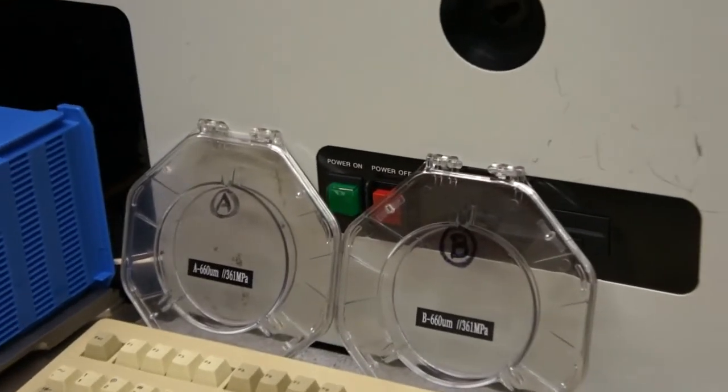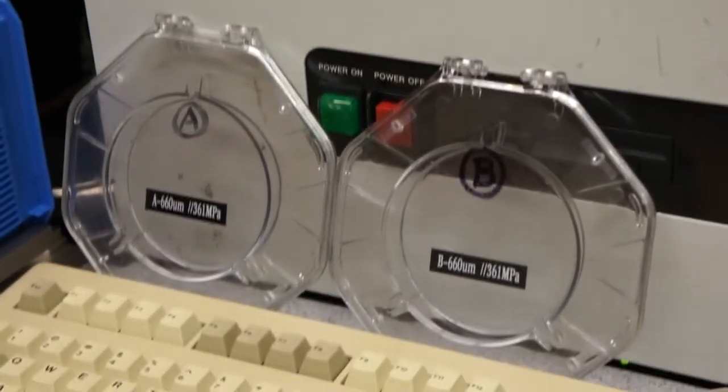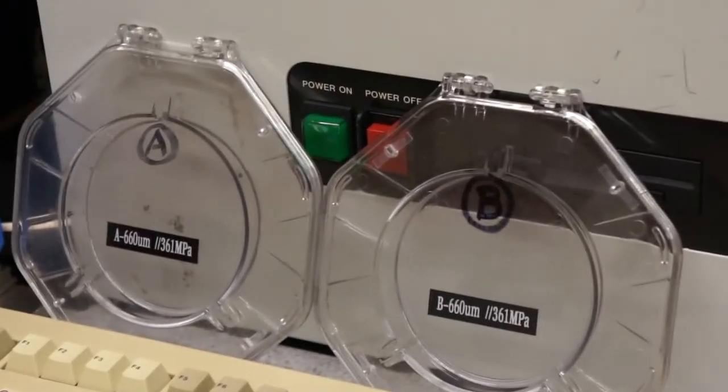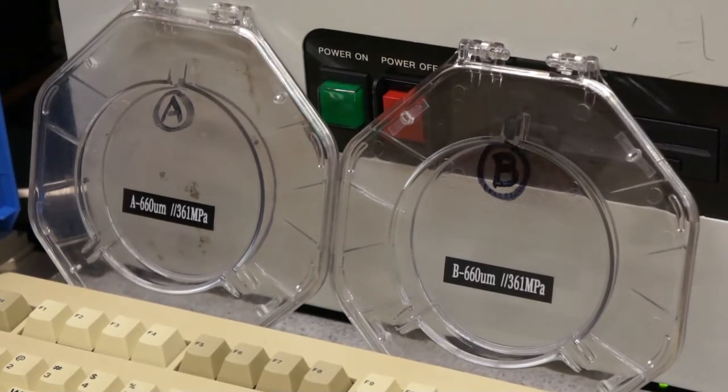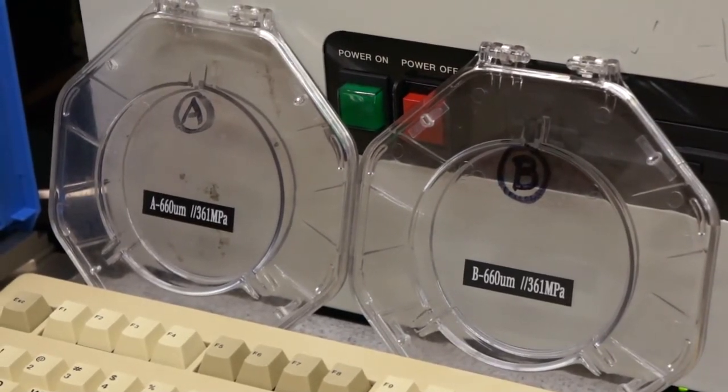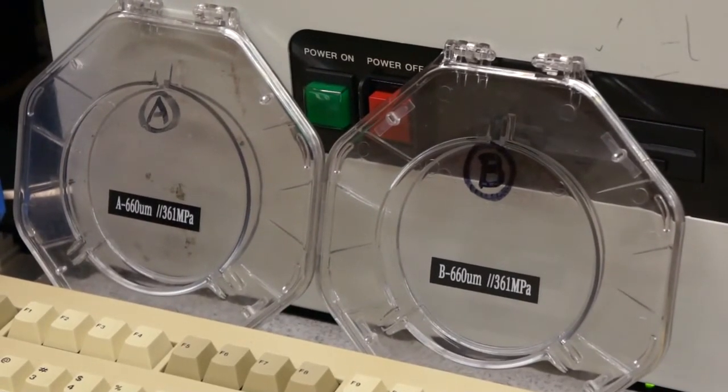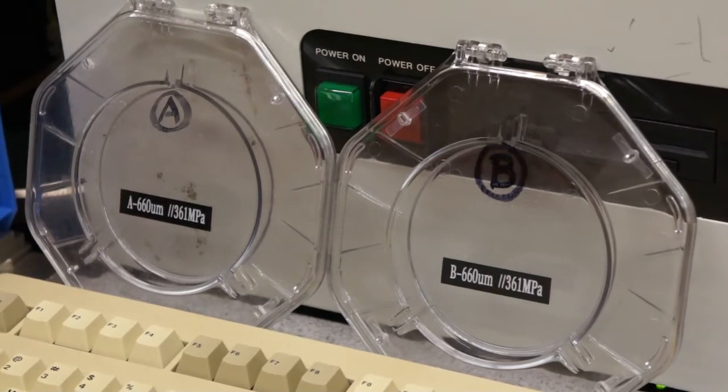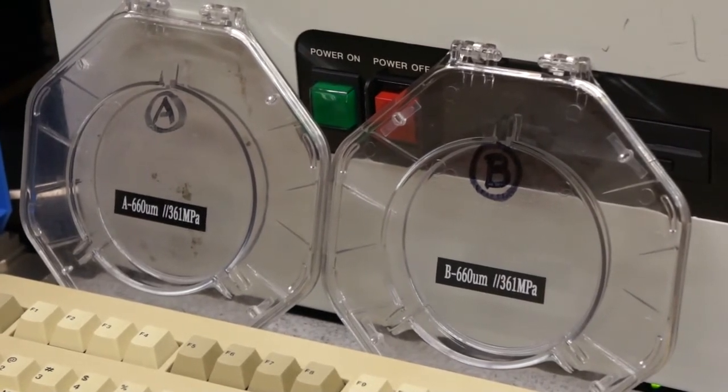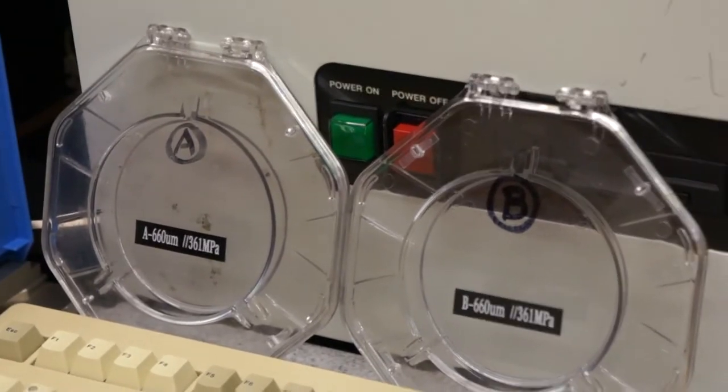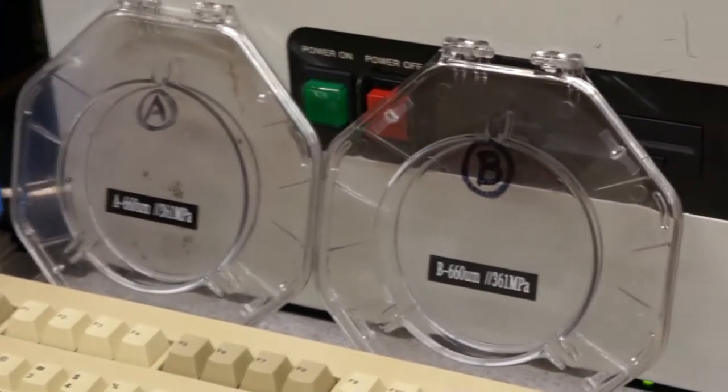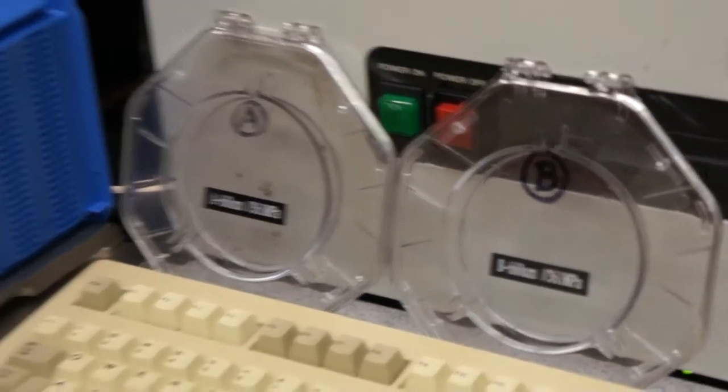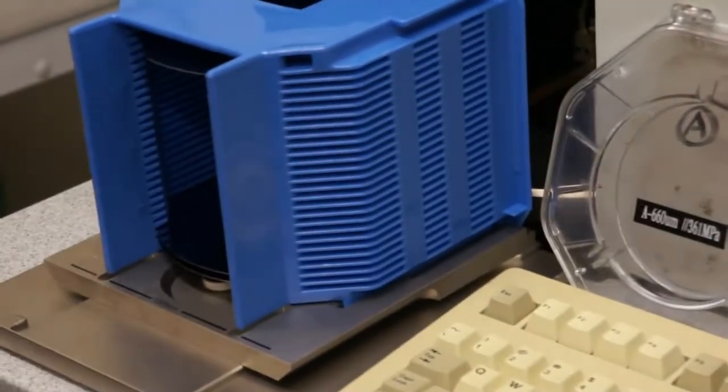We have an AB wafer set here. Our scale should measure wafer A and should be plus minus 1 micron on the 660 micron thickness. And when our measurement is complete, this is for a calibration check, we should be within 5% of the 361 megapascals. So our wafers A and B are already loaded in the cassette.